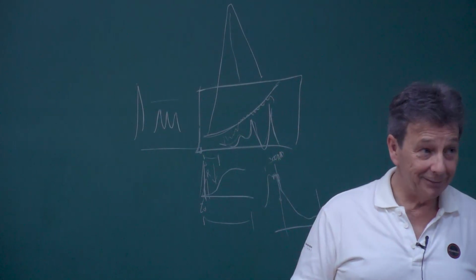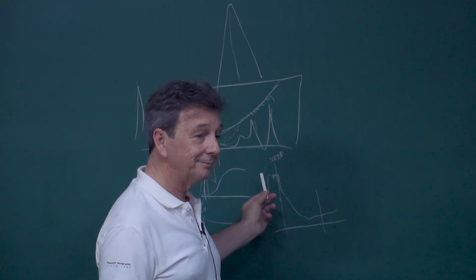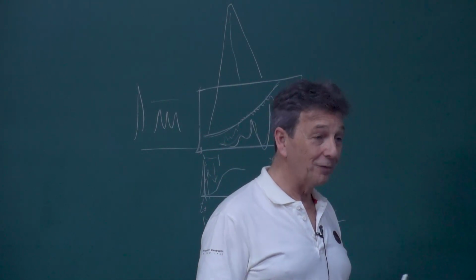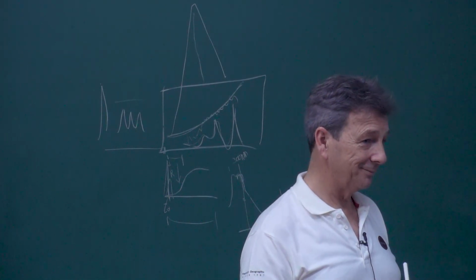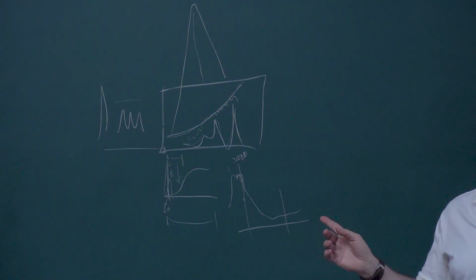And the spectrum will be dominated by this part of the sample. Imagine that this part of the sample is 5% of the sample. So you get a beautiful spectrum of an anecdotic part of the sample, and then you make all your story about something that may not be representative. That's why when you go to the ultraviolet, it is very important to be aware of this.